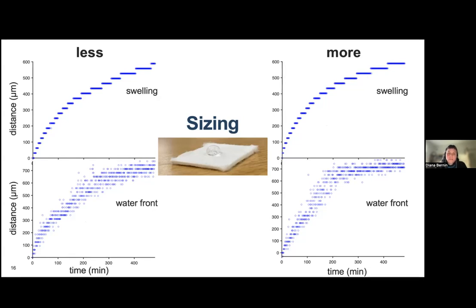So that would be interesting to test next: instead of water, to look at oil and emulsions, for example, some kind of dressing when you think about salad, or also coffee and other things. But this technique seems to be rather good at picking up the dynamics of how the liquid is transported into these materials.